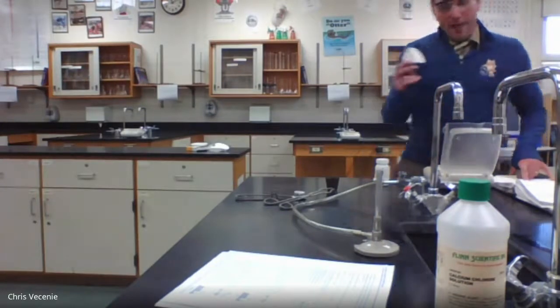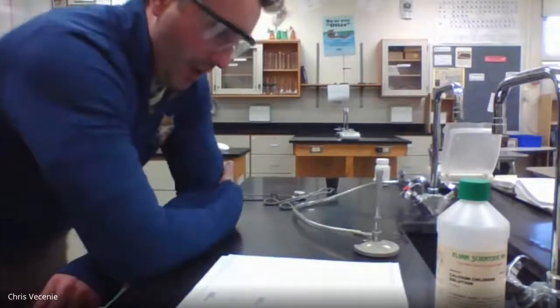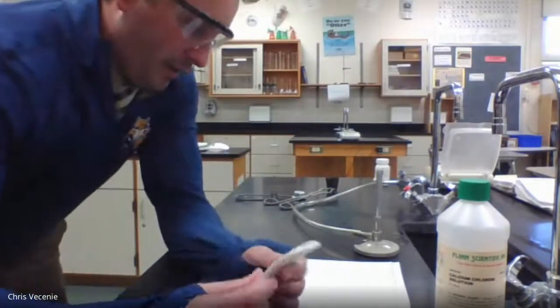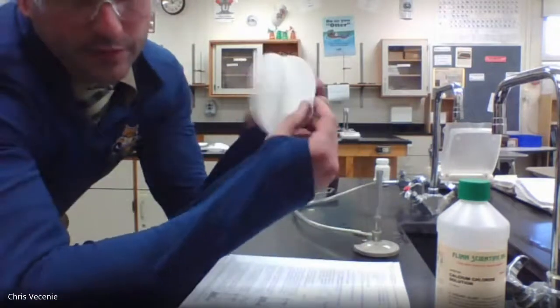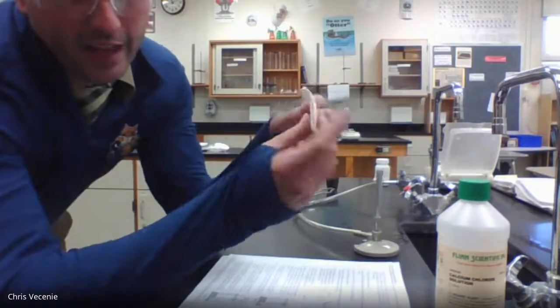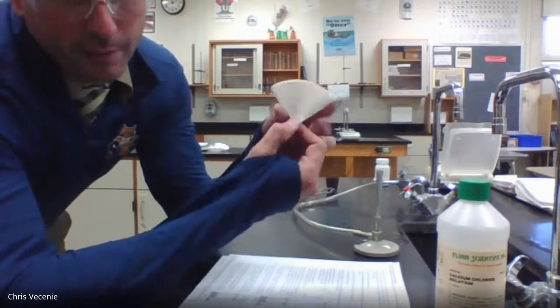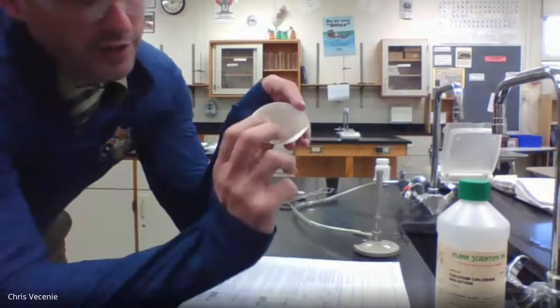All right, now we've got the mass of our filter paper, and they're walking us through how to prep it. They said, let's go ahead and fold it so that we can create a filtration system. So you take your paper, fold it in half. You got a half, then you fold it in half again, and you got a little pizza pie. And when you do that, you create a window that you can filter on the top.